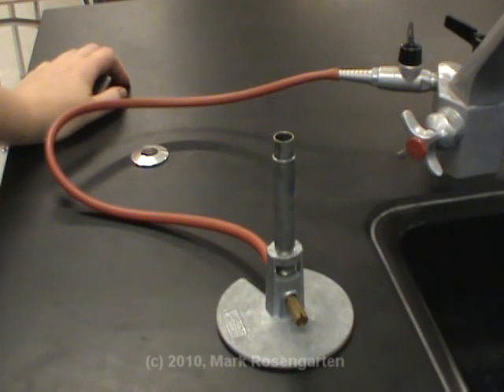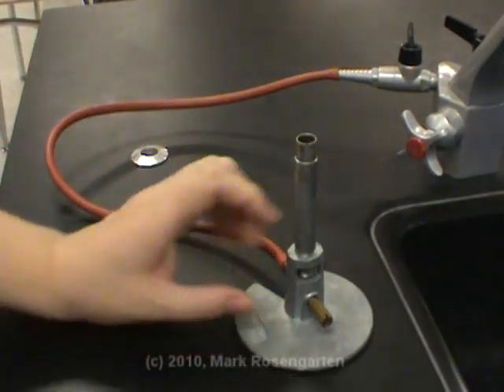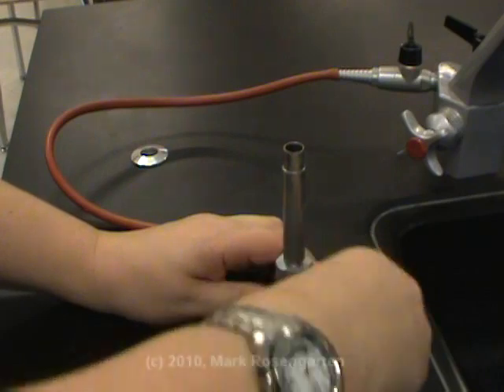Here we have a Bunsen burner, a device that we use in the lab to heat stuff up. Basically what happens is we take methane gas from here, and it is stopped by this needle valve right here.